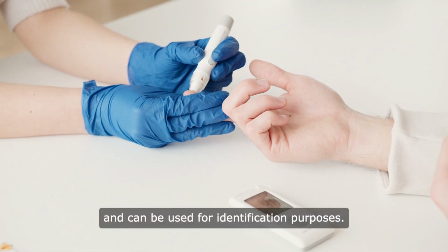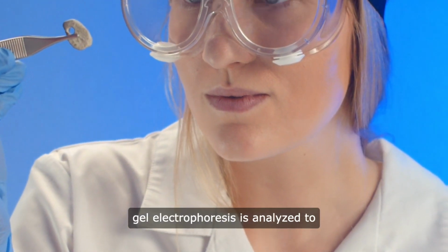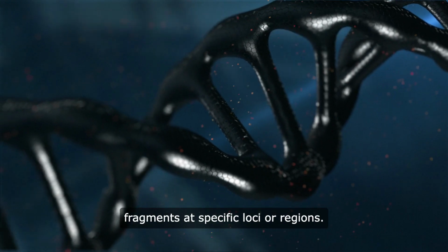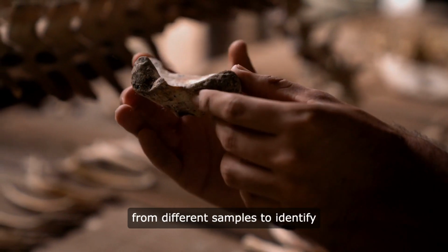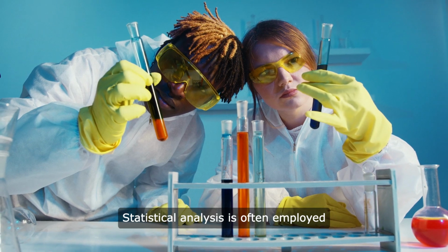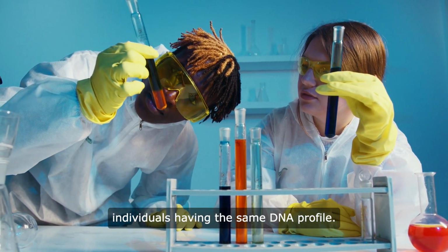Analysis and interpretation. The DNA fingerprint obtained from gel electrophoresis is analyzed to determine the number and size of DNA fragments at specific loci or regions. Scientists compare DNA fingerprints from different samples to identify similarities and differences. Statistical analysis is often employed to calculate the probability of two individuals having the same DNA profile.